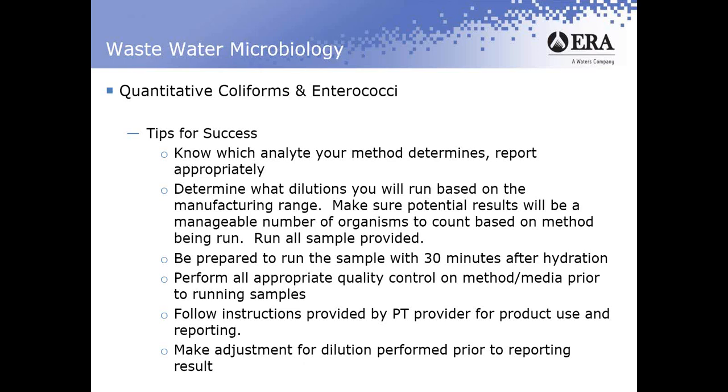Follow the instructions provided by the PT provider for product use and reporting. Make any adjustments for the dilution performed prior to reporting the results. You're given the units that you're expected to report the result in. Make sure that that's in fact what you're doing.